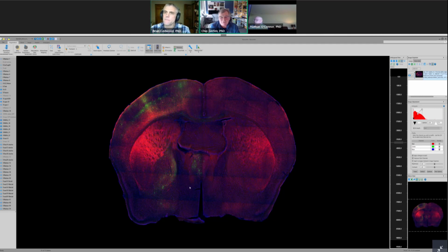Yeah, but the answer is, another thing is that typically I try to use focal planes that are above and below the section itself, so that the things are out of focus, and that doesn't interfere with the deep focus algorithm that's applied.